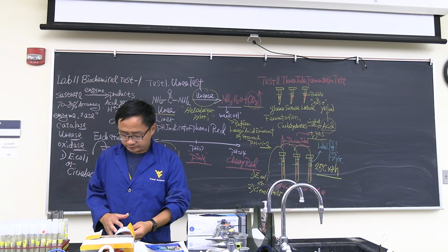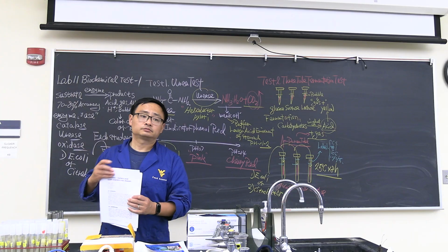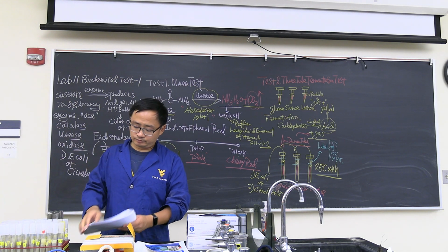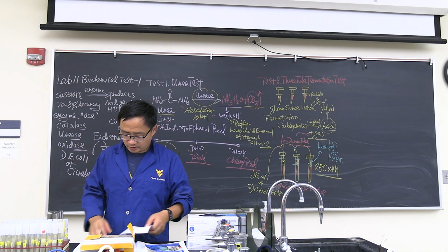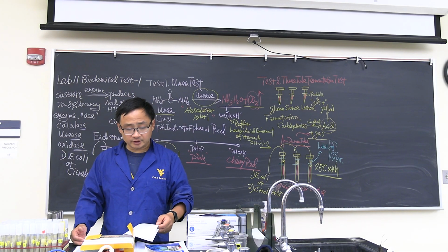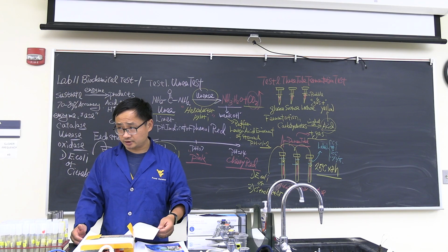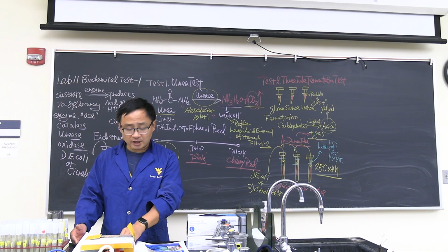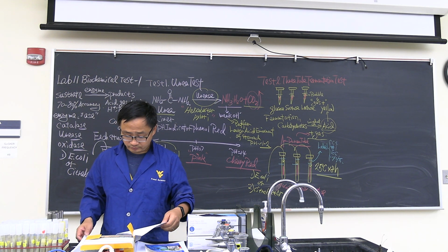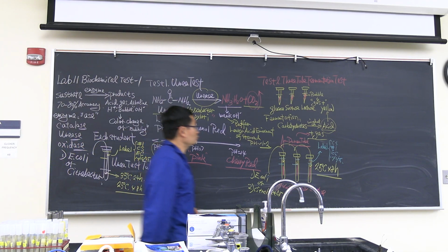Where is the material? The material is chapter 19. And do not forget, go ahead and read. These are very good material, which is more concise than what we put in the eCampus after-class reading. So, this chapter you should read to prepare for the lab, and also prepare for the lecture exam. Now what are we going to do? The next one is a throat culture.